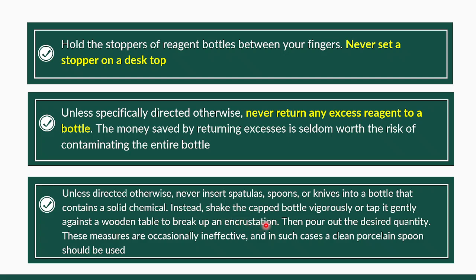So ato siyang iduk-duk diha sa wooden table. So ato siyang i-shake. Ato siyang uyugon og maayo, paspas, with full force. Or kung dili pa gyud siya mag-separate with one another, ato siyang iduk-duk sa wooden table. Then, pour out the desired quantity.